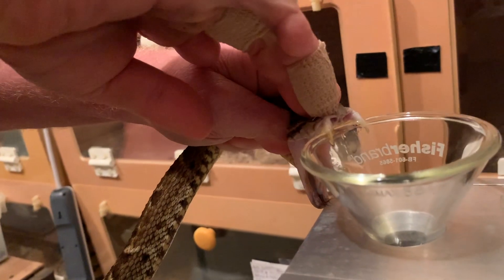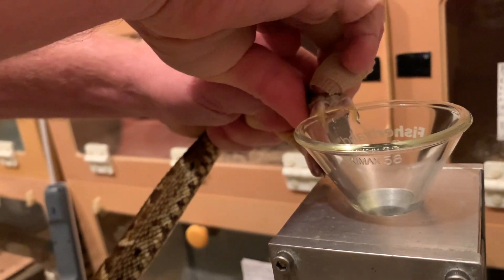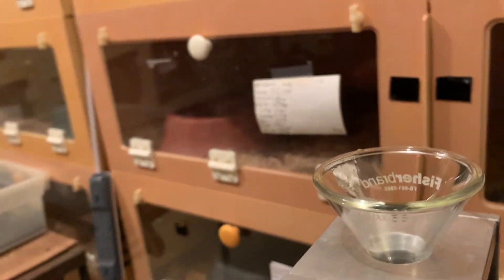Let me try to see if I can get a little bit to show you the fangs. That's not really working — I'll try next time.